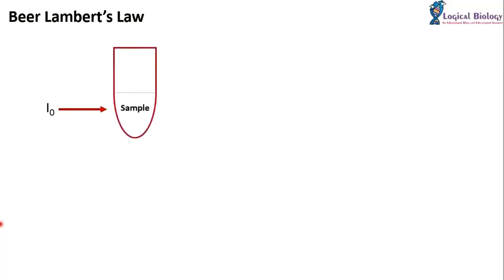Now we have a test tube where our sample is filled and we are putting a light of intensity I0.